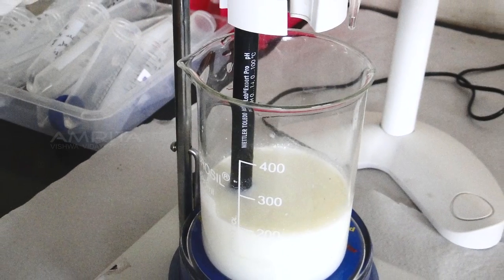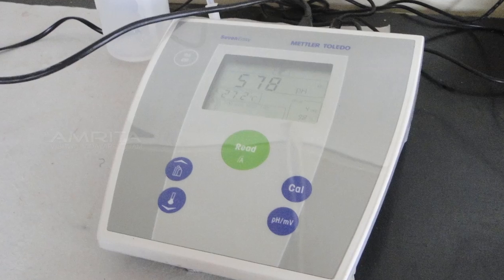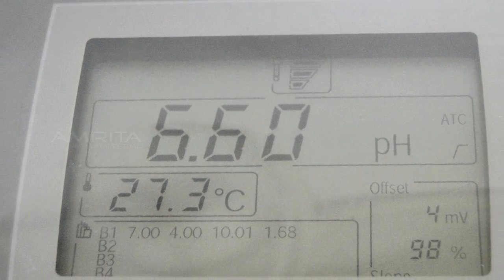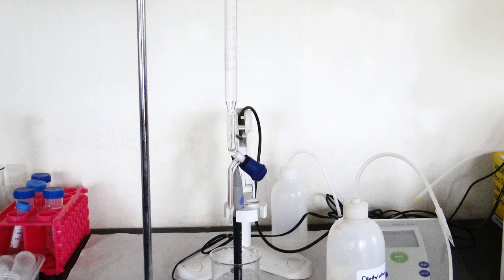Dip the electrode into the beaker containing milk and check the pH. The pH should be approximately 6.6. Now arrange the apparatus as shown.